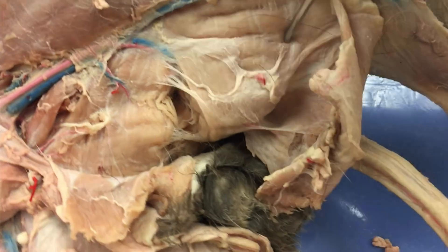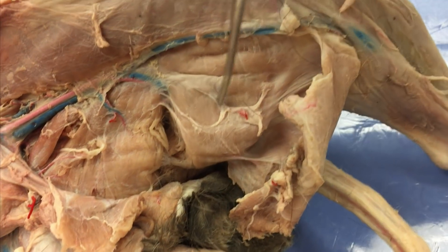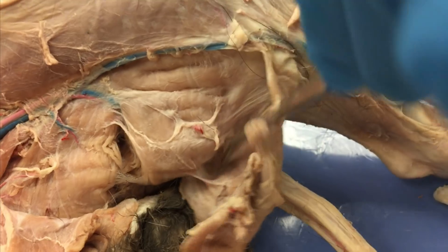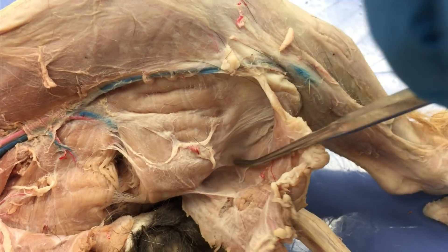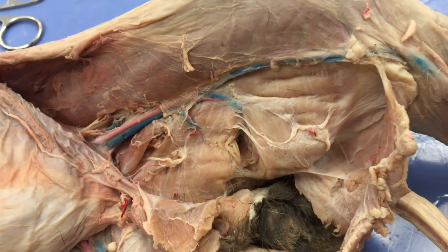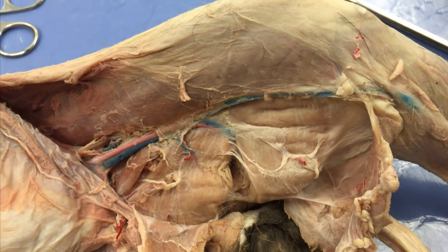Down here we can see one of our hamstrings. This big muscle here is our semi-membranosus, and if I'd cleaned and pulled my fascia away properly, I'd be able to see the semitendinosus back here as well. Now I'm going to flip the cat over and we'll take a look at the posterior hip.